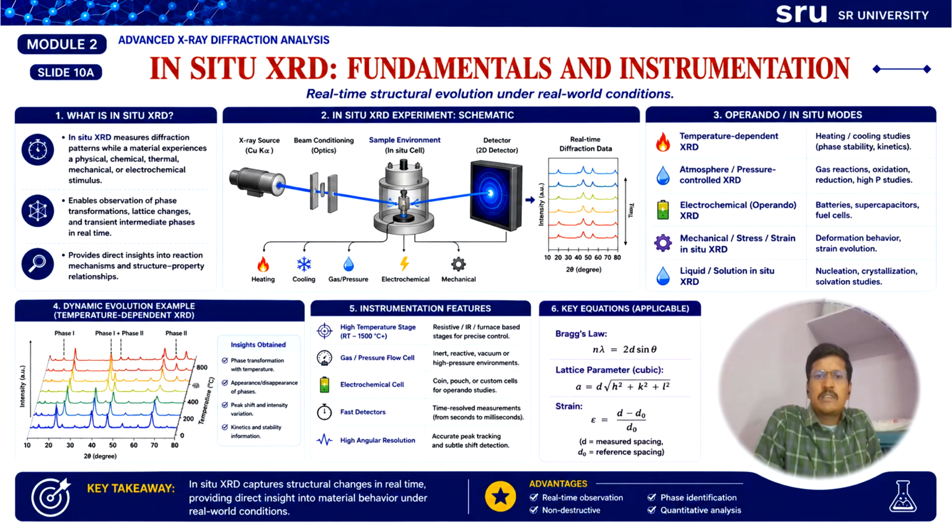It eliminates uncertainties associated with ex situ XRD measurements. Finally, it improves our understanding of reaction mechanisms and material performance.